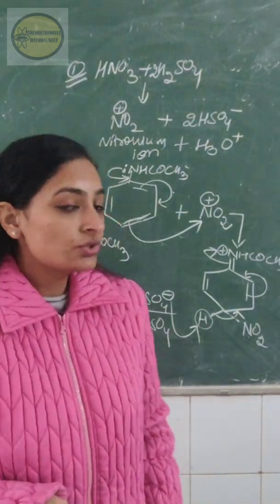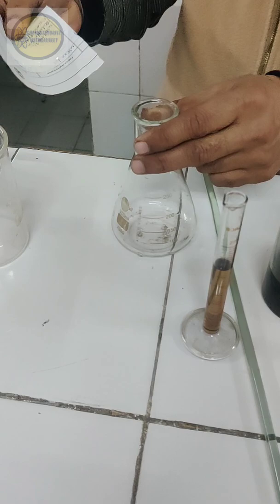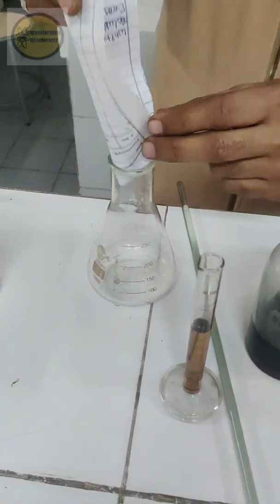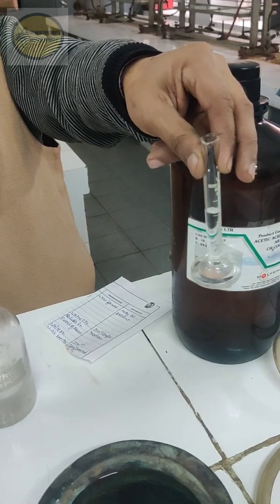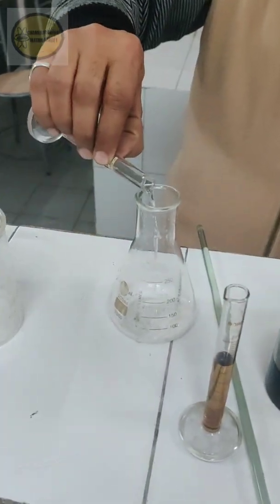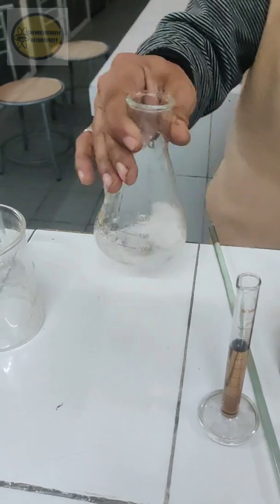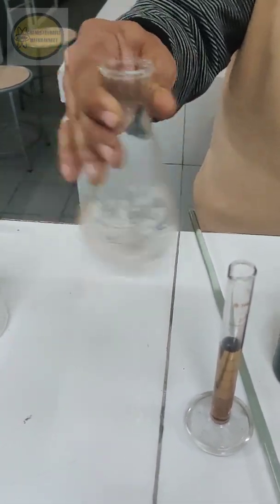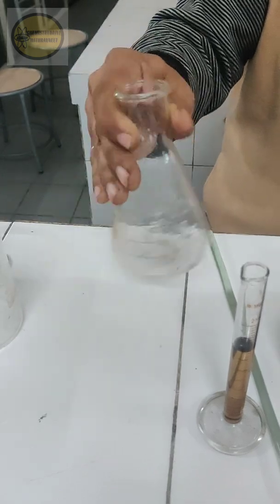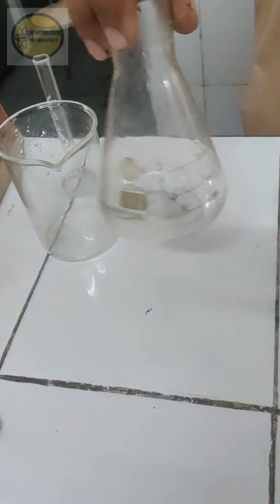Now let's see the preparation of this whole product. For the preparation of para nitro acetanilide, first of all what we are going to take is 4 grams of finely powdered dry acetanilide, and we need to dissolve it in 4 ml of glacial acetic acid. So use measuring cylinder to measure exact 4 ml of your glacial acetic acid. So we are transferring this whole solution to the conical flask and stir it properly. And you can also warm the content if needed to obtain the clear solution. As you can see we have obtained the clear solution. Actually we warmed it, then we obtained the clear solution.